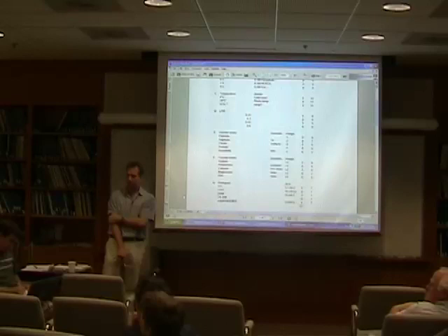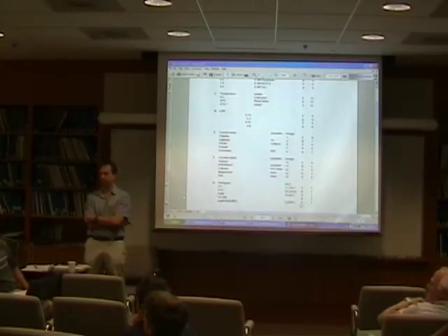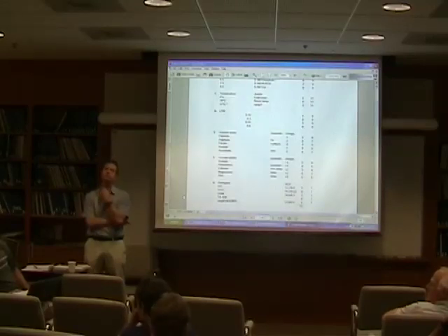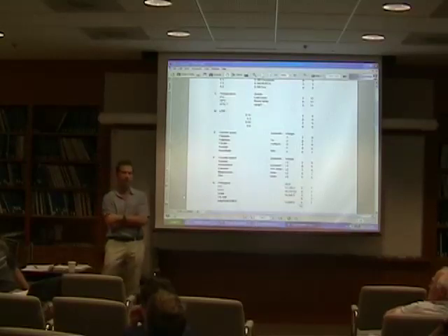Anyways, it's not a sedimentation at equilibrium, what you suggested. What Vincent does is that we simply try to separate aggregates from non-aggregated protein, with the postulate that in presence of lipid, the protein is associated with the lipid and then floats at the surface. So this is a good hypothesis, and a good postulate after reconstitution. So you can do that, just put your samples on a 2 molar sucrose gradient, you spin it down at high speed. If you have protein at the bottom, it's aggregated. So even if you're not sure about the top, you can eliminate the ones at the bottom, which simplifies your scope.